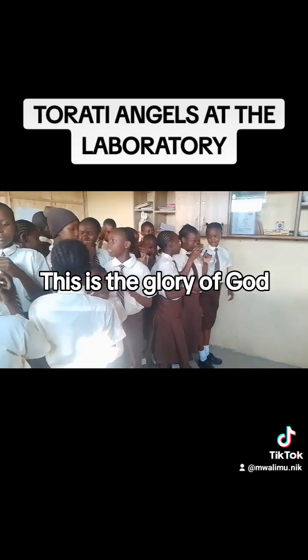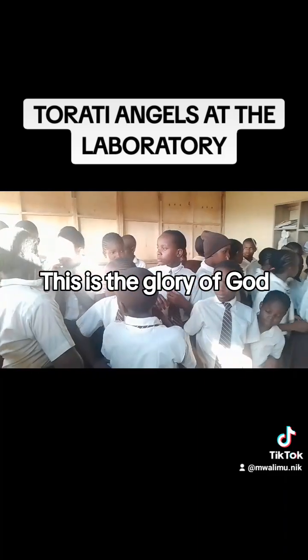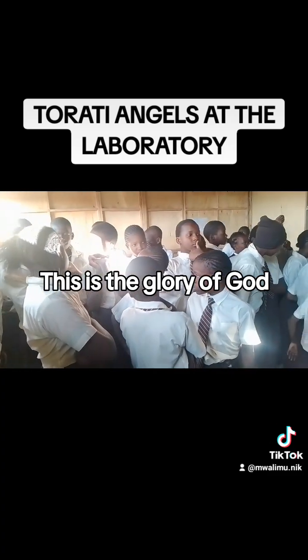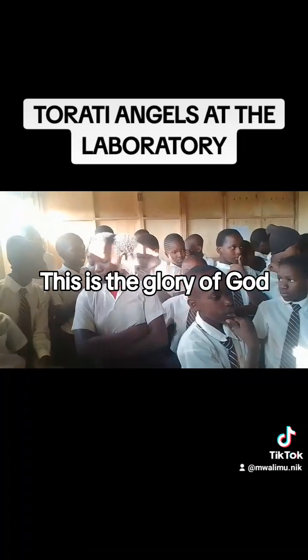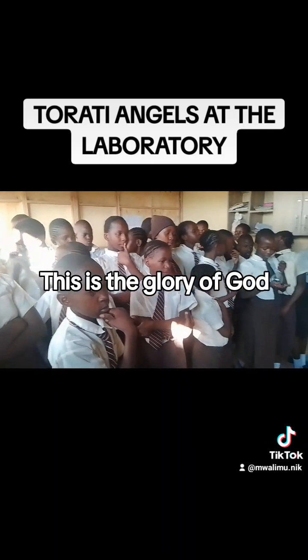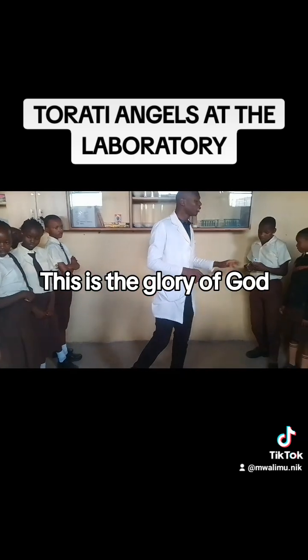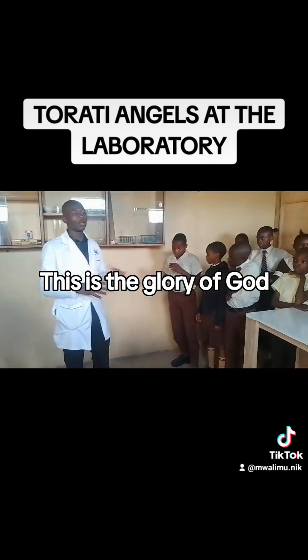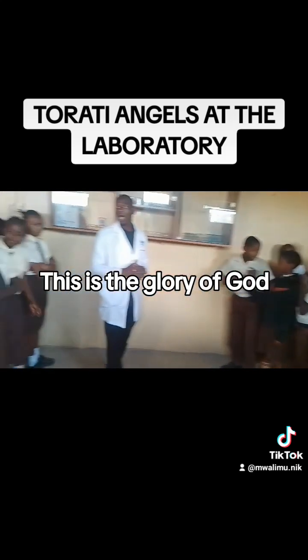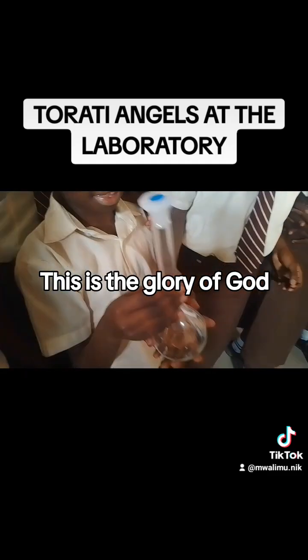Maybe the chemical is one that can evaporate. So you can insert the cork stopper to seal. Once you have sealed, no gases or vapor will evaporate. So this one is known as a volumetric flask. I want you to have a look at how it looks like.